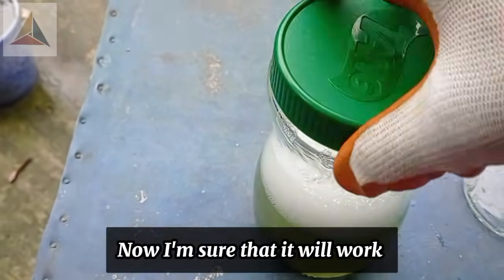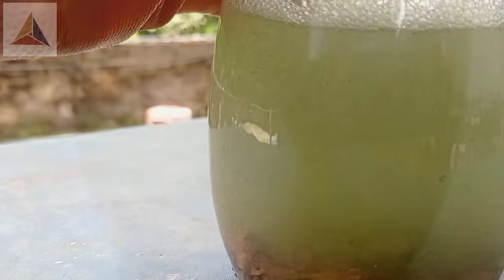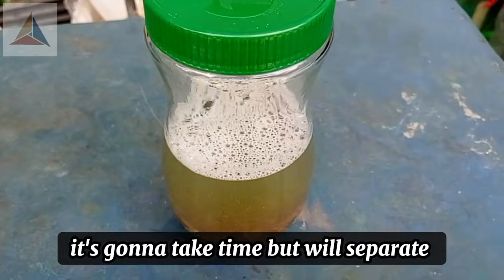Now I'm sure that it will work. Day 7: gold flakes are separating slowly. It's going to take time, but they will separate.